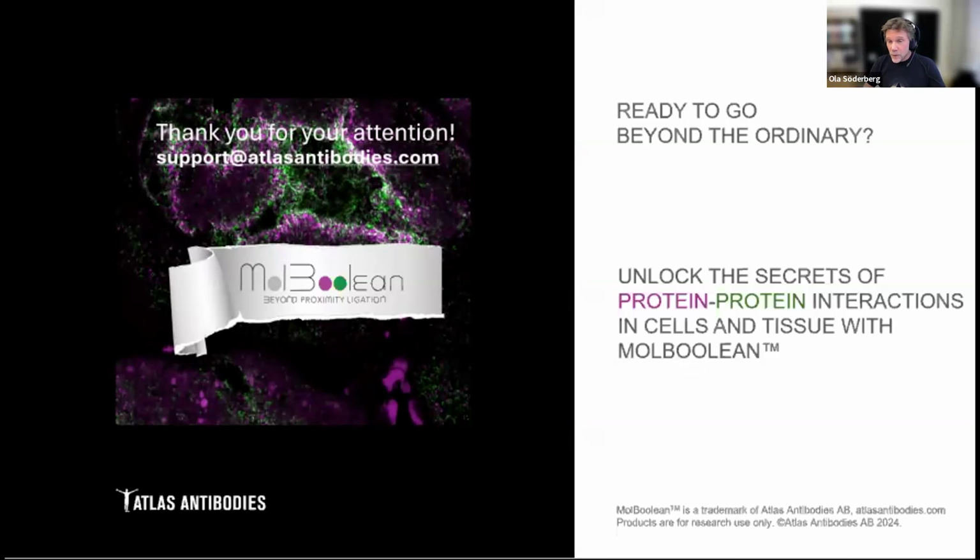So it's a bit complicated, but we are also trying to develop approaches where you get them in three different colors. So you get free protein A and B in separate colors, and you get the protein interaction in a third color. So it might be easier in the future, and you won't need as advanced image analysis as you do for MolBoolean. This is something we're working on, and maybe Atlas will have it in future versions.